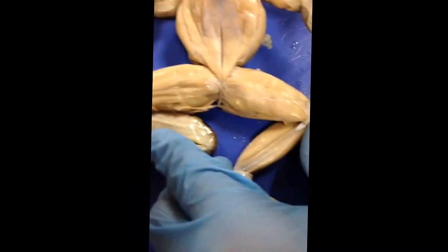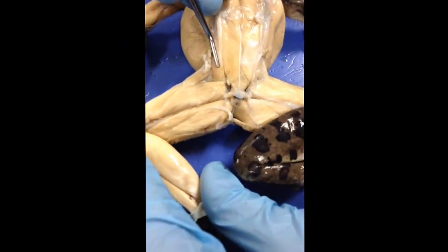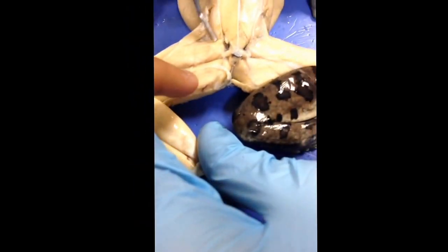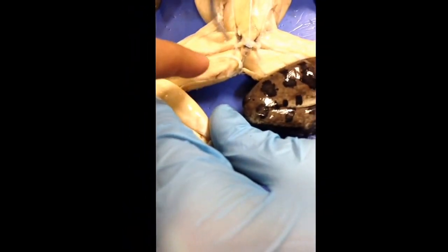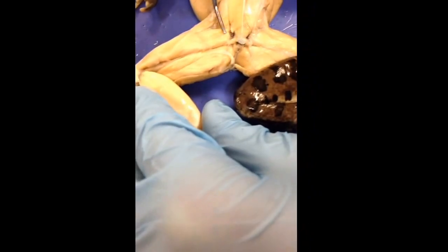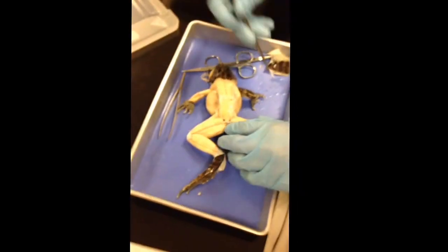The next one is the sartorius. It's the bottom one — that's the top. I think it's this one; it's this on the diagram. It's below it, like right here. And that is the musculature anatomy of a frog.